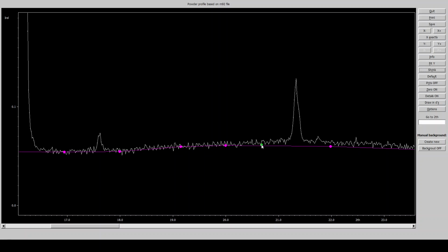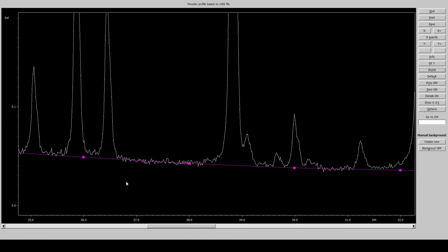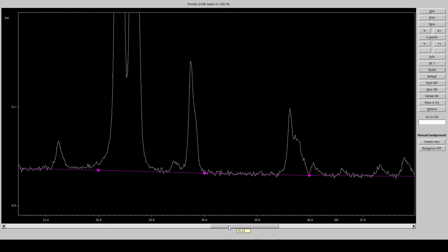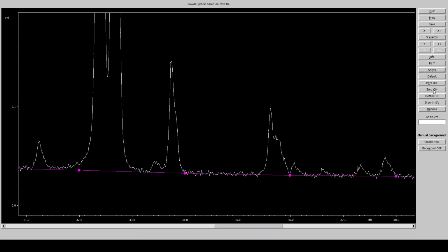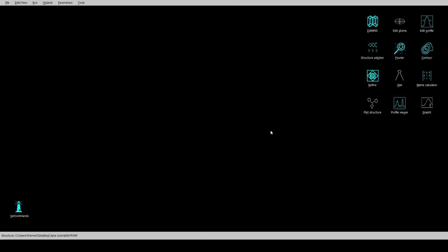So let's go and do the background. Okay, looks good here, here also. This I'm going to put here, and let's agree that it's okay for now for the video. Yeah, it's pretty good. So I'm going to quit and suppress the points using polynomial terms. Then I'm going to click the edit M50 here.